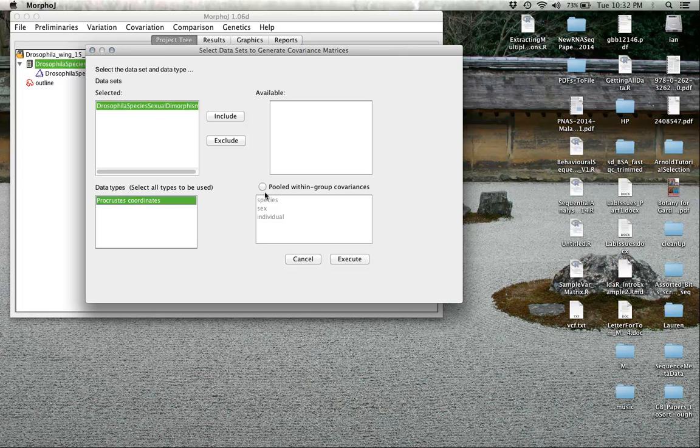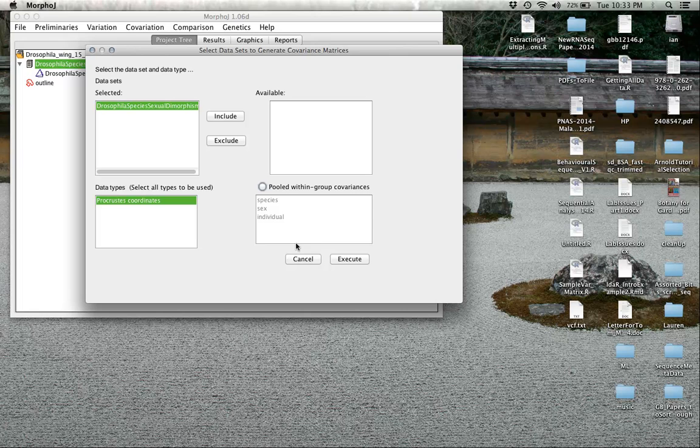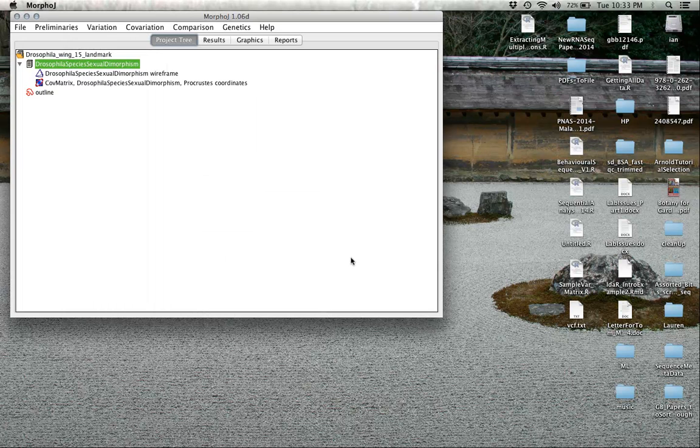We don't need to worry about these options right now, although later it may be worthwhile looking at within group covariances to adjust for aspects of species or sex. But for here, we're just going to leave those as the default and hit execute.